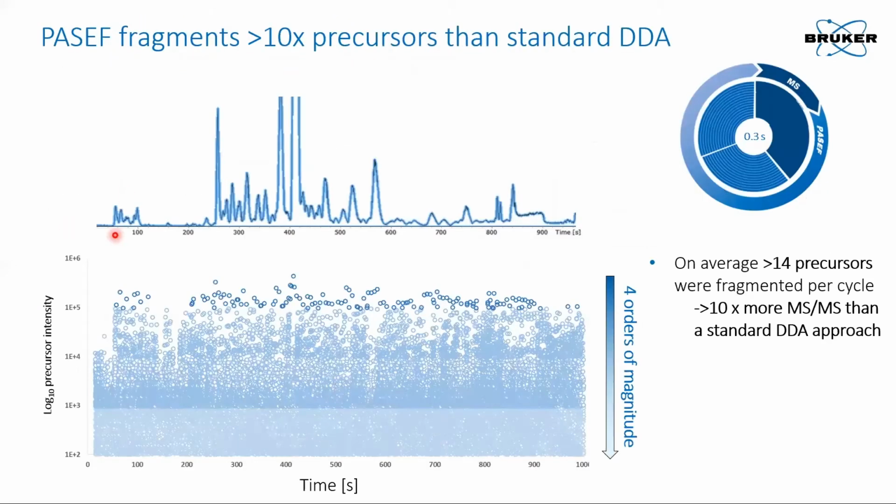Now here you can see the base peak chromatogram for this sample. So for the C. elegans, you can see it's an extremely complex sample which is composed of a number of lipids. And if we look at this in more detail, so here we can plot the LC separation, and we can plot it versus the intensity of these features which are being detected within the C. elegans. Now with PASEF, we fragment much faster than with any other fragmentation method.